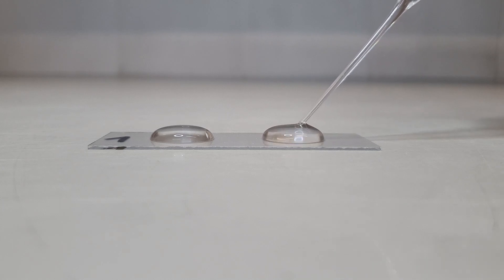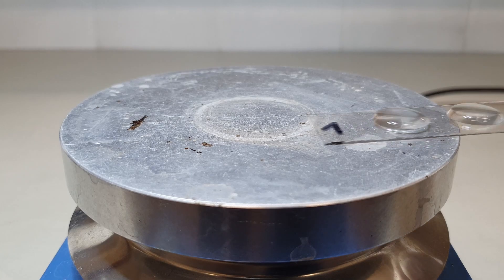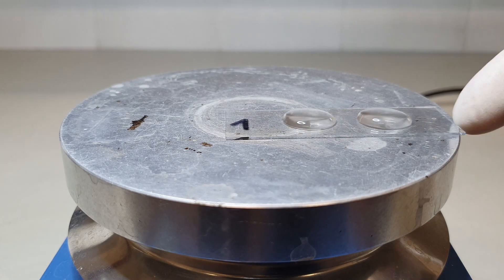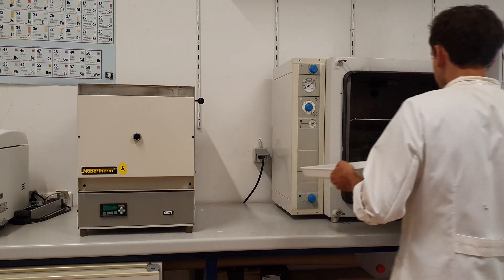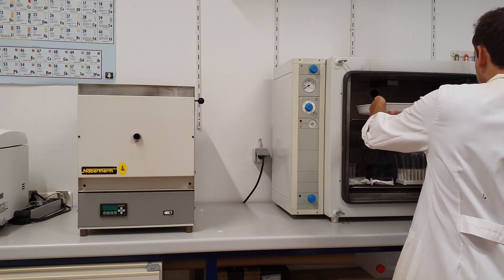We recommend letting the cover slips dry overnight at room temperature to evenly spread the diatoms over the cover slip. When time is limited, a hot plate or a drying oven can also be used to speed up the process, but consider that diatoms tend to agglomerate when drying at elevated temperatures.